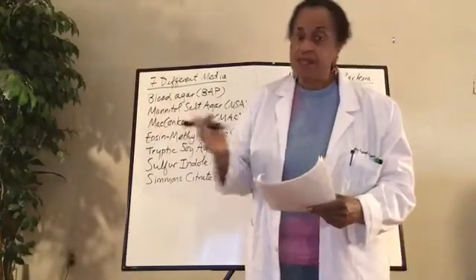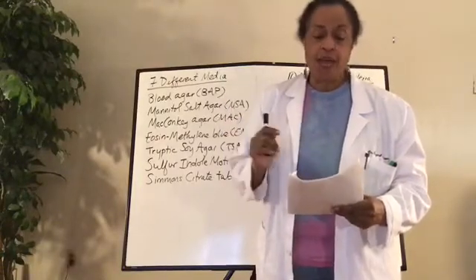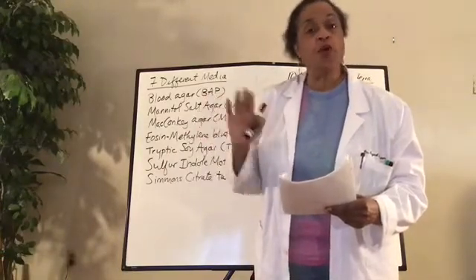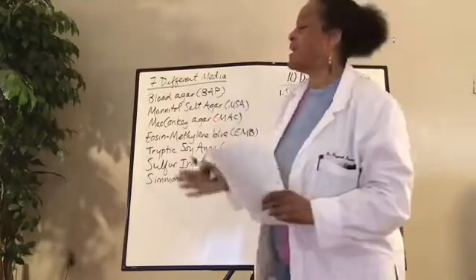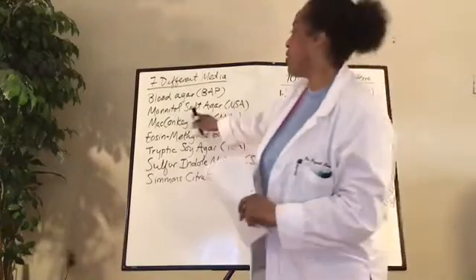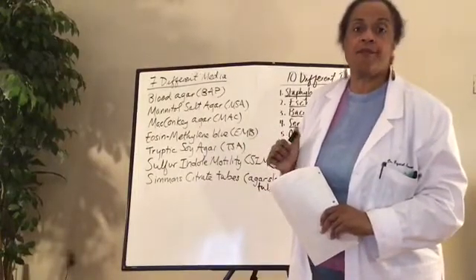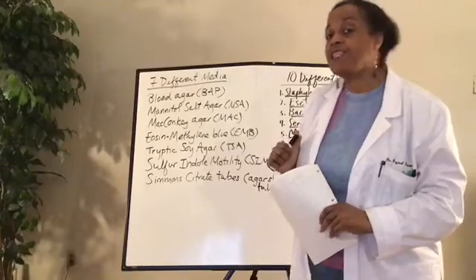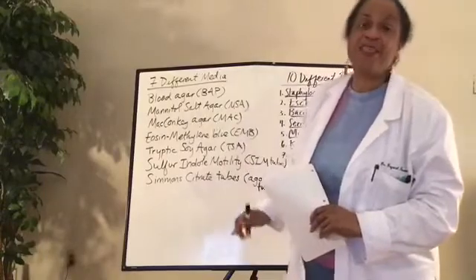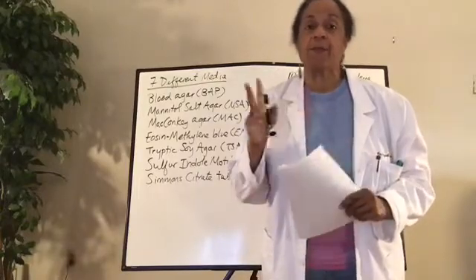Selective media is a little different than differential. Selective media contains one or more agents that inhibit the growth of certain microbes. So certain bacteria won't grow because it's selective. This media may be selective for only a certain kind of bacteria. So mannitol salt agar is definitely selective for Staph aureus. I just said it was differential too, didn't I? Well, perhaps, and you have to let me know, mannitol salt agar can be a differential and a selective media, can be both.